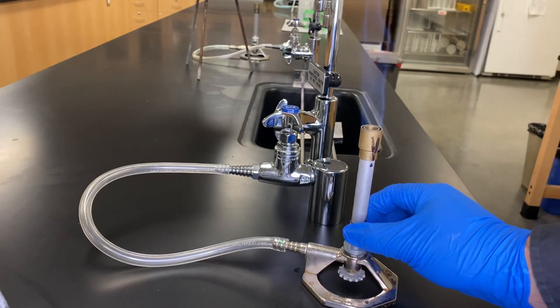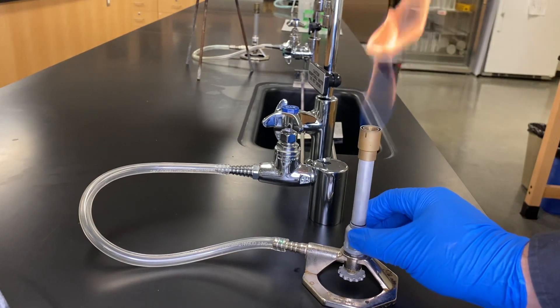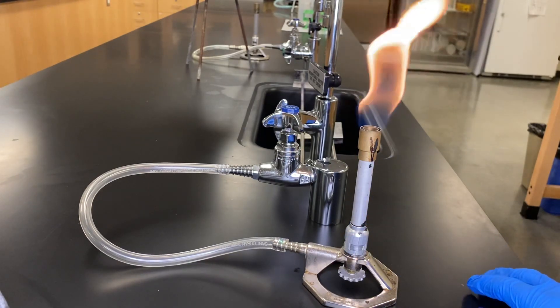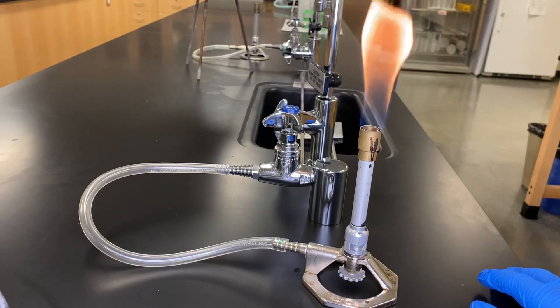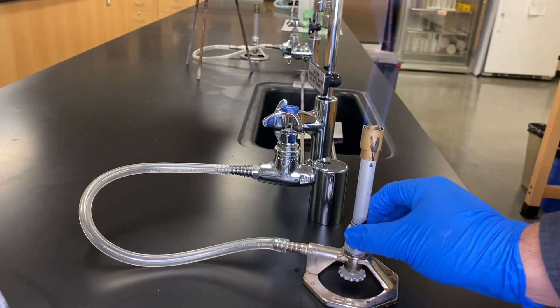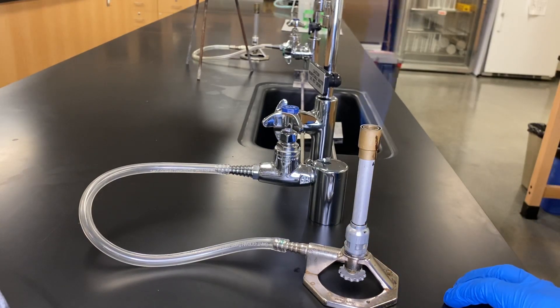And then if we close it even further, it'll turn into your classic orange-yellow flame, which is the coolest of the flames that we have, so lowest temperature. So when we're boiling things, we're going to want to have it at this kind of blue temperature kind of color.